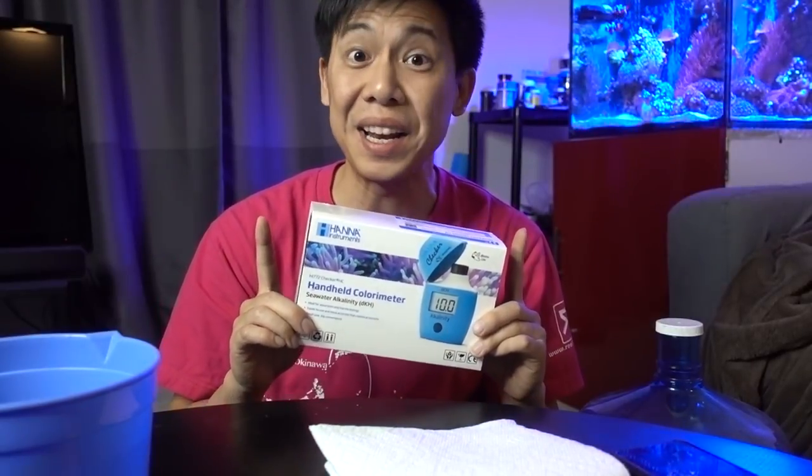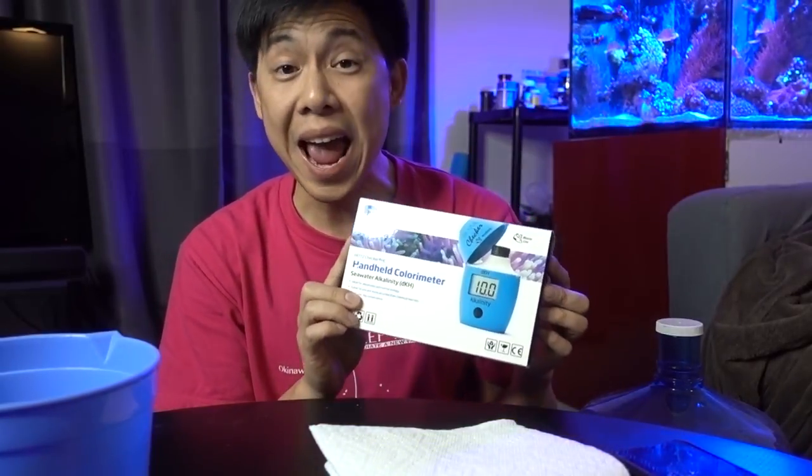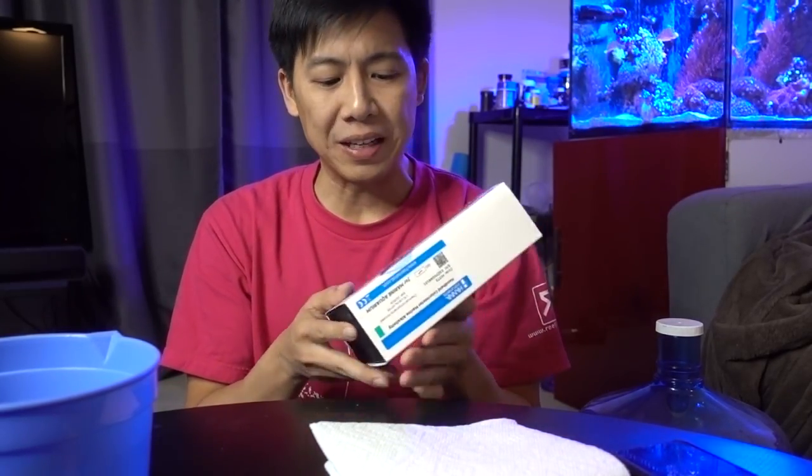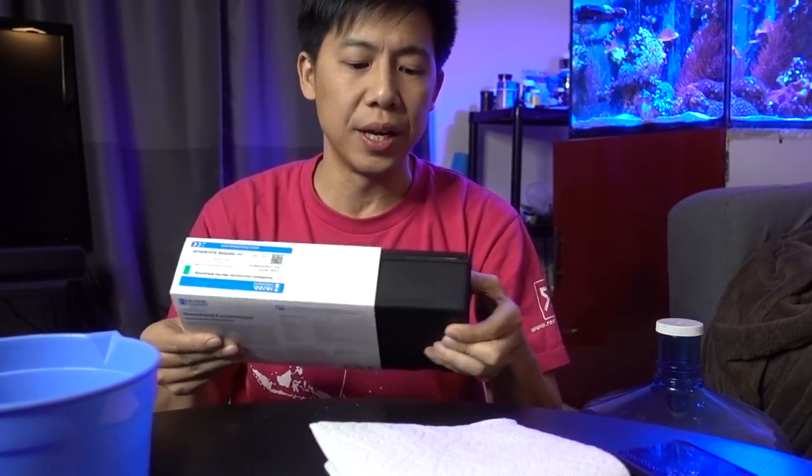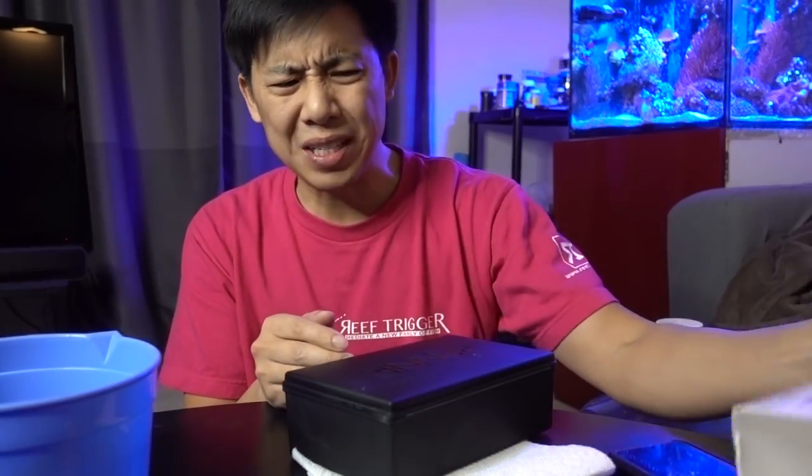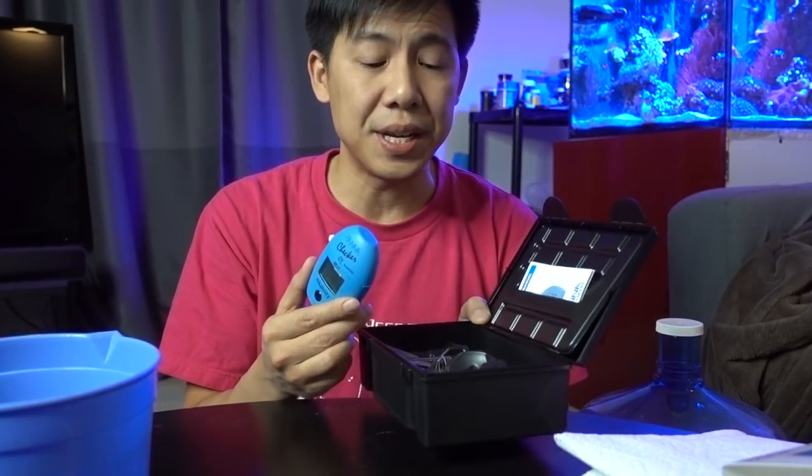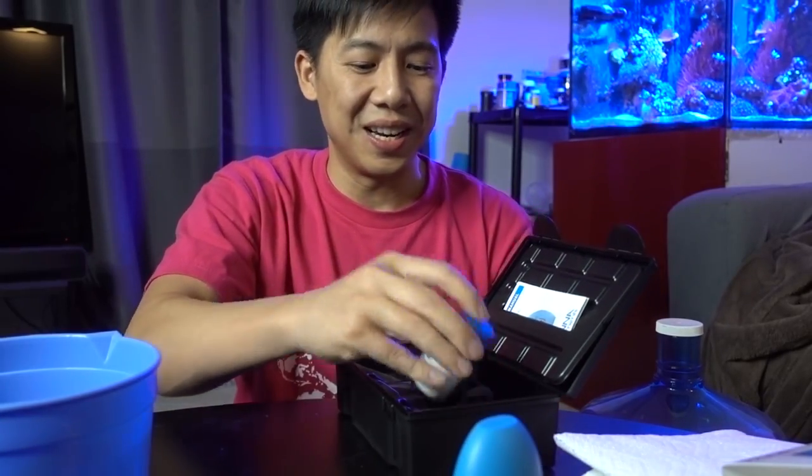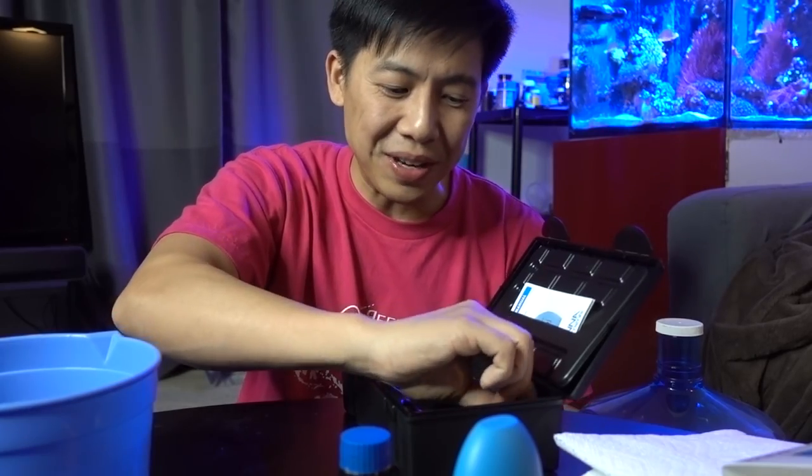If there's one test kit that I like the most, it's the Hannah ALK Checker. This is by far my favorite test kit. Super painless, super clear, super easy, well worth the money. I think it's like about $40 or something like that. This makes testing ALK painless. There's no reason you will not test ALK if you have the Hannah test kit.